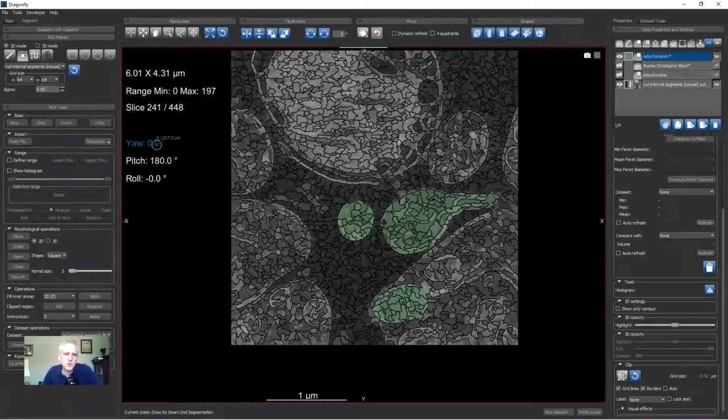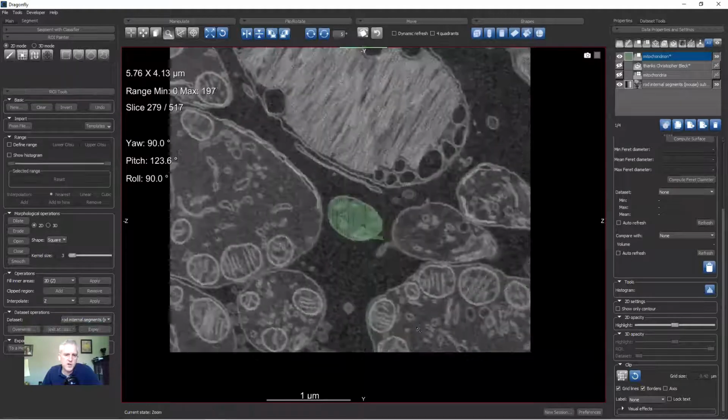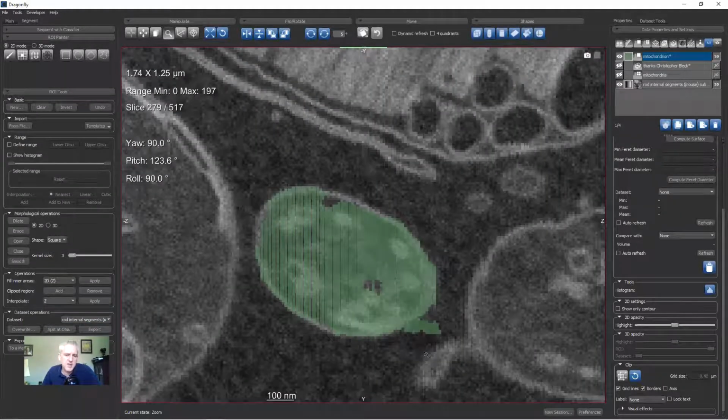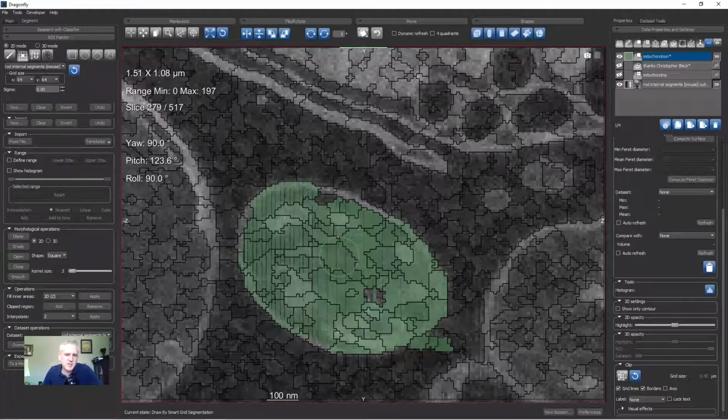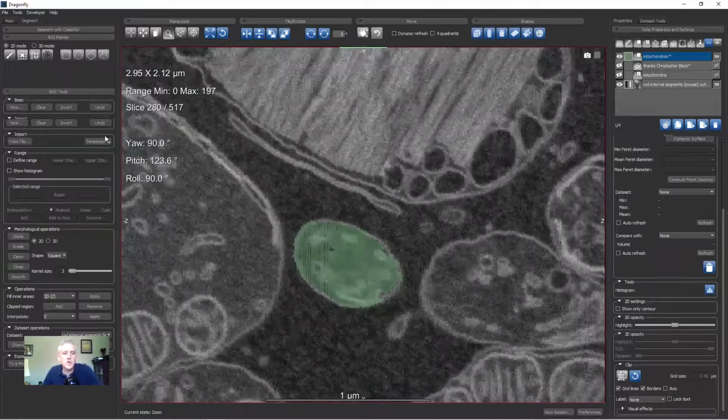Just like the other tools, if I go to some oblique slice, it still works. You can still grid the image. Now there are these interpolation artifacts you may notice. It looks like it's not painting. That's just the way the data is being sliced. It is painting everywhere, and it's just an artifact of what a discrete ROI sample looks like when you're looking at it from different angles. So you can use these tools.